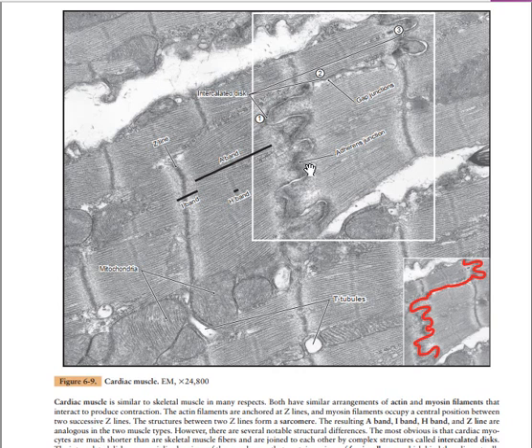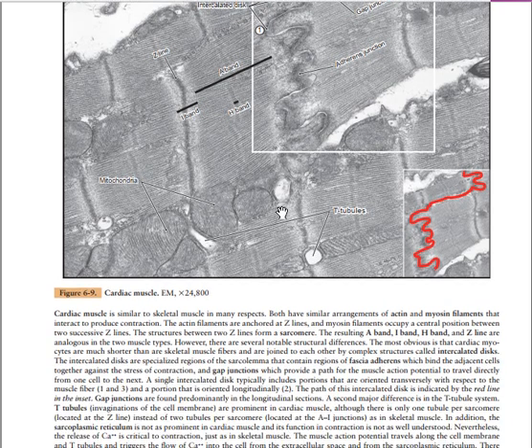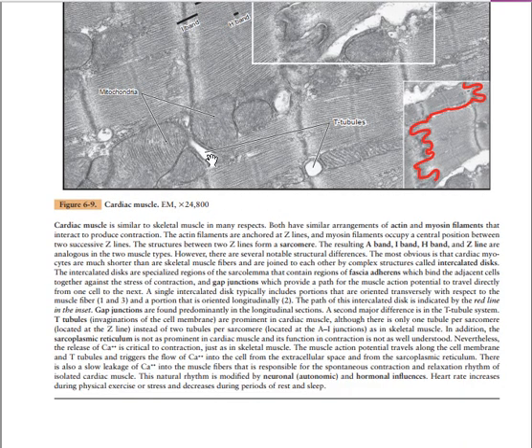Also, the intercalated disc is made up of the adherent junction. We have already visualized the peculiarity of the adherent junction in the tutorials you've done before. We have gap junctions also, within the intercalated discs, in order to increase the transmission between one muscular tissue and the other. Now you also have here the transverse tubules, and you can visualize the arrangement of the transverse tubules here.